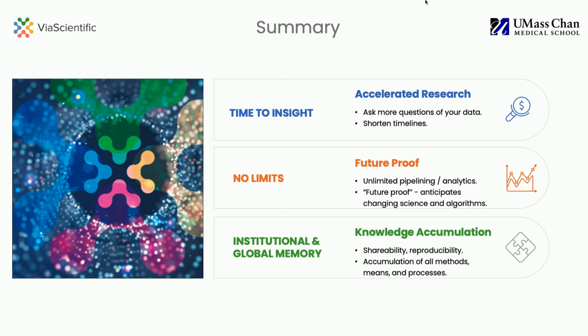And also, you can always go back and see what you did before, and you can recreate or reproduce all the results you ran before. For example, I had a bear project, and they brought me 12 samples.